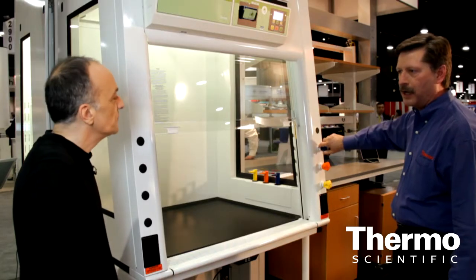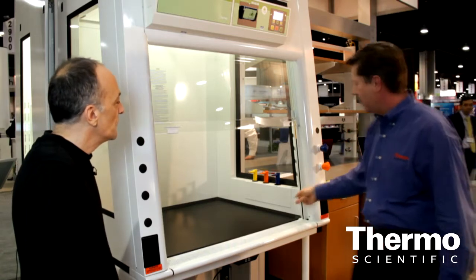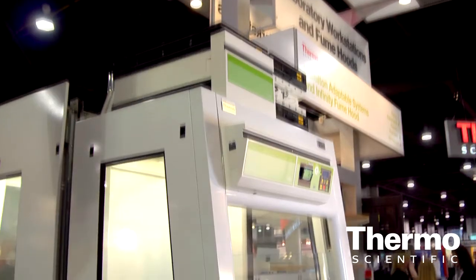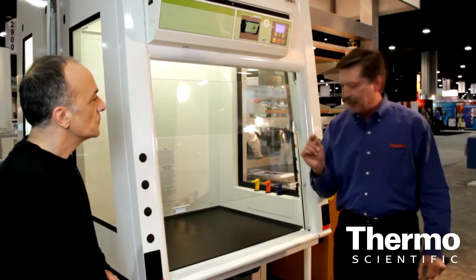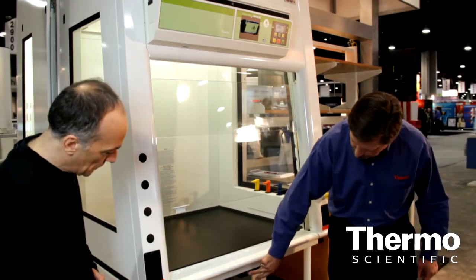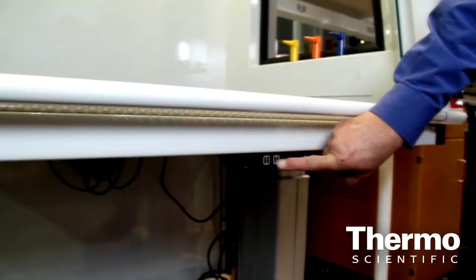You control the volume all the way on, or it's completely off. From your front-loaded fixtures, we have copper going to your points of service distribution. Some of the things we incorporated this year into the technology are mobile units — these are now on casters — and to make it user-friendly for ergonomics, we've also incorporated an electronic hydraulic mobile unit.